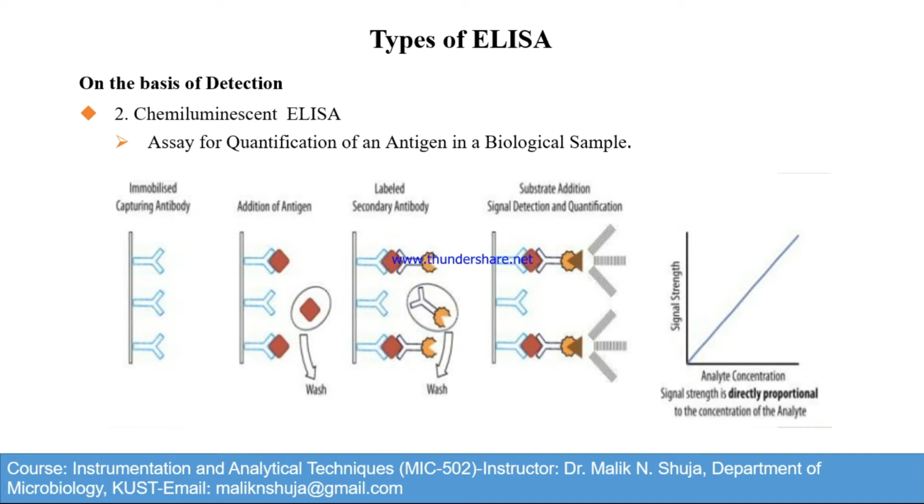In this type of ELISA, an antibody coated on the plate specifically binds to the desired analyte. Following washing steps, a detection antibody and enzyme label are added which bind to the analyte. A substrate is finally added to generate a reaction in the wells.